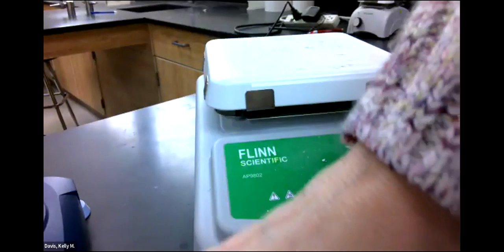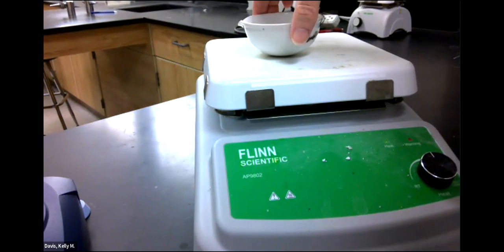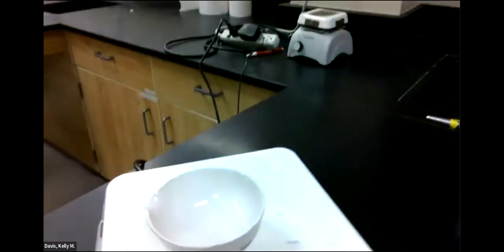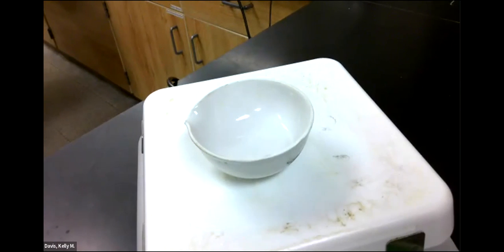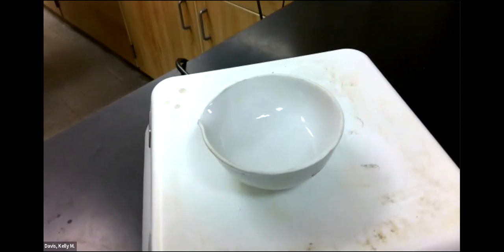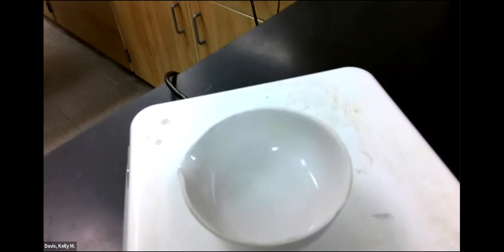It's going to get really hot, so I will use tongs to remove it. I turned the hot plate on a little bit earlier to try to make it a little bit quicker. It should start to boil shortly. And then I might just pause the video if I have to wait a while. Just watching water boil is not so exciting.